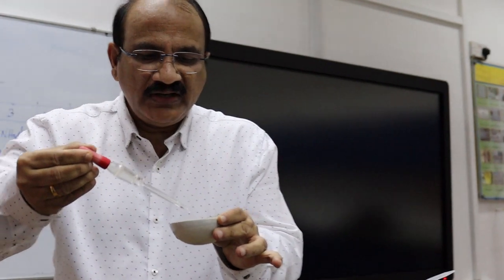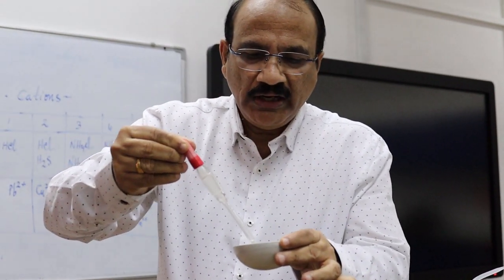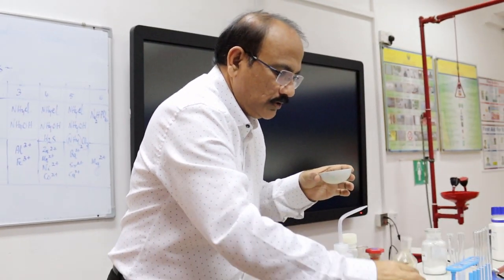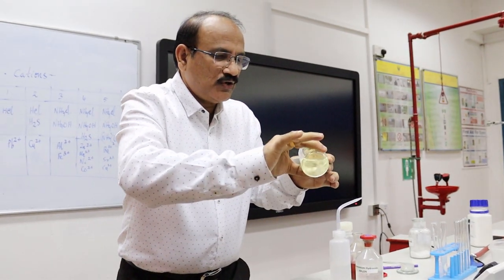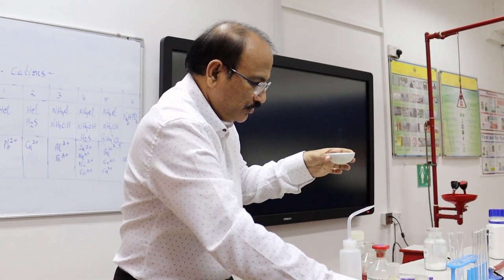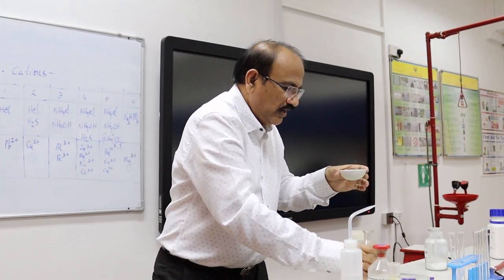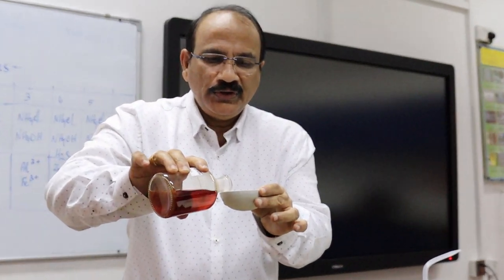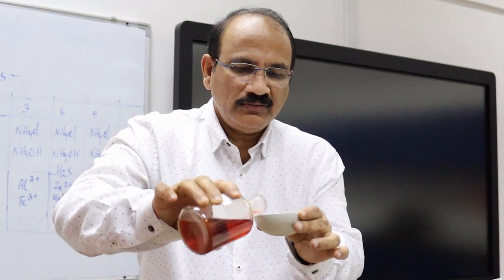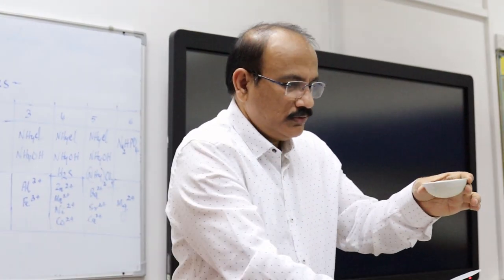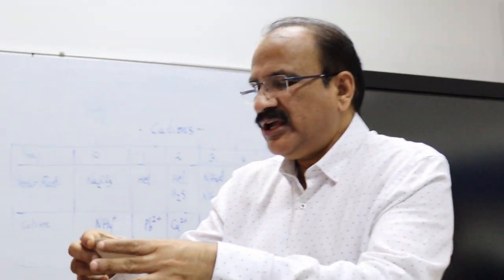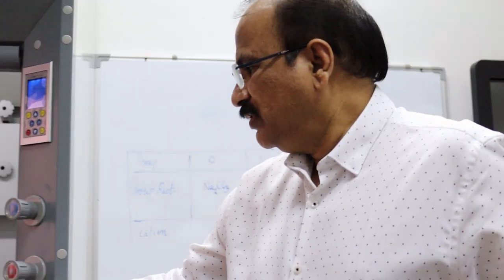For that, we will take the salt and add concentrated nitric acid. This is concentrated nitric acid. And into that, we will add a few drops of cobalt nitrate. It is added, and now it will be kept for boiling.